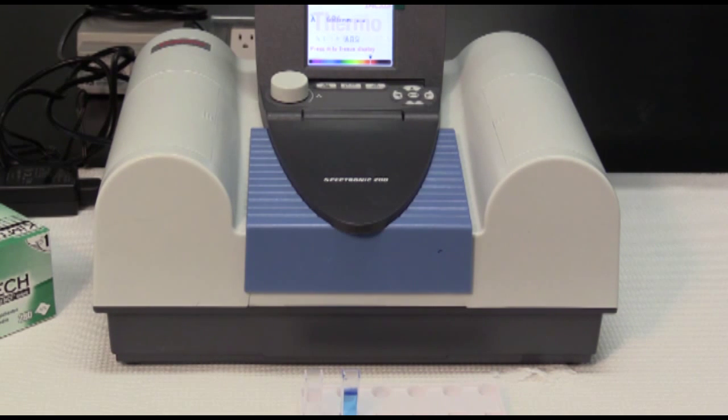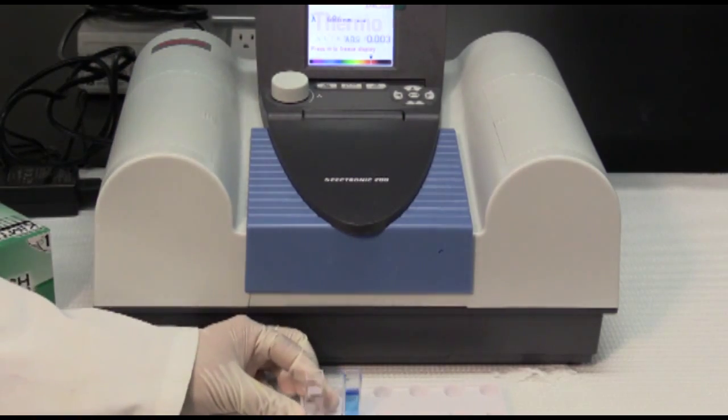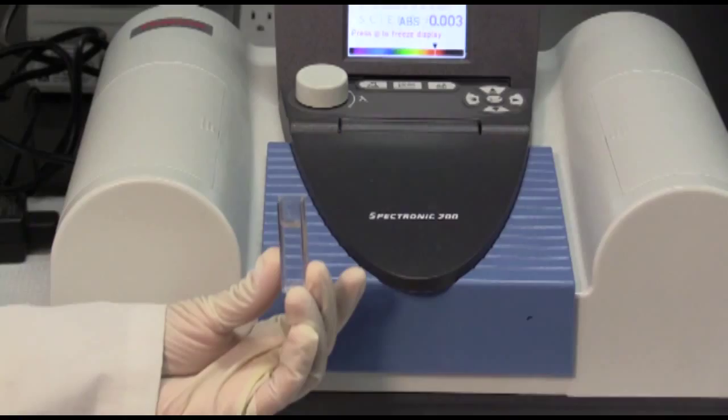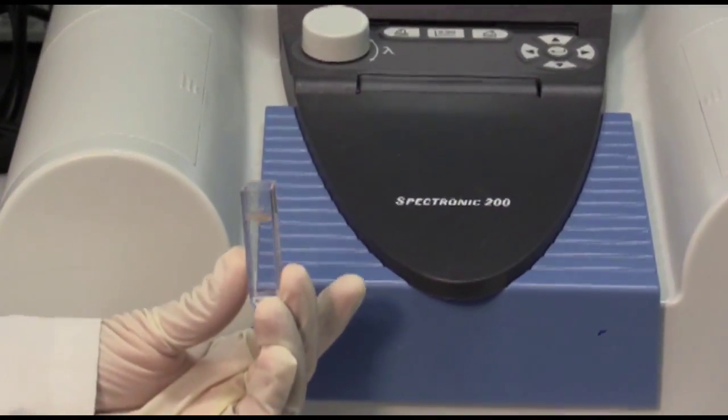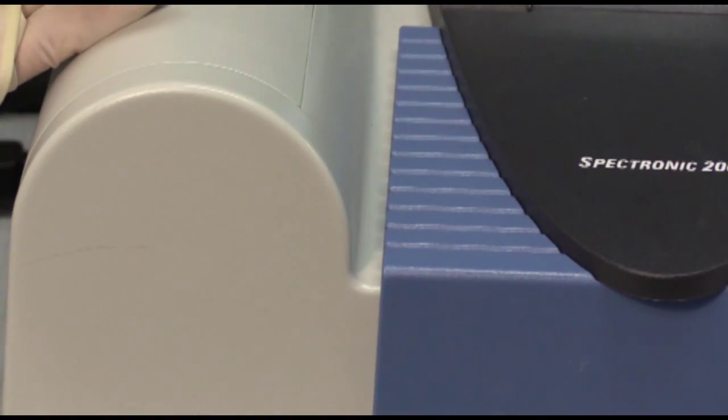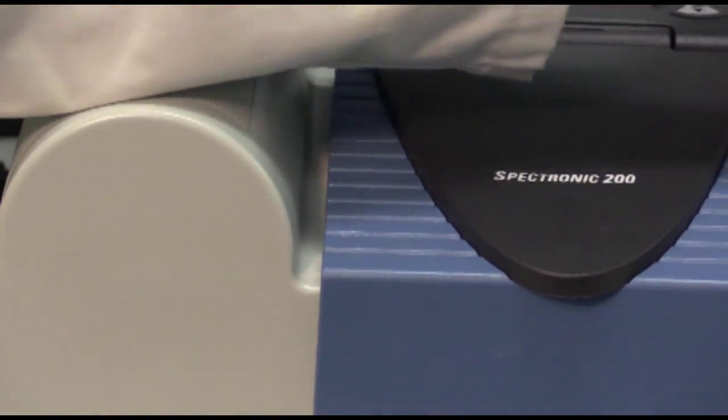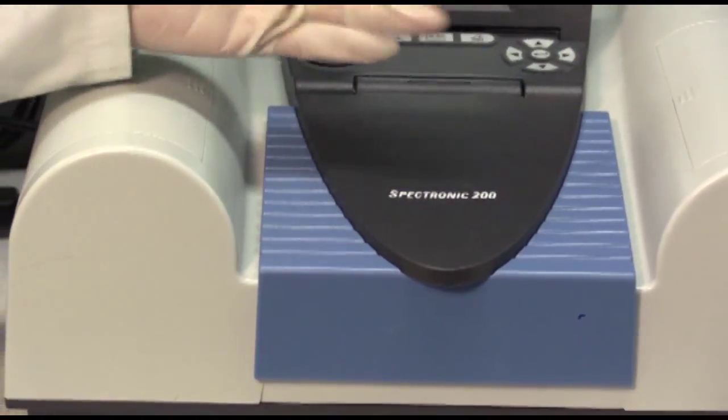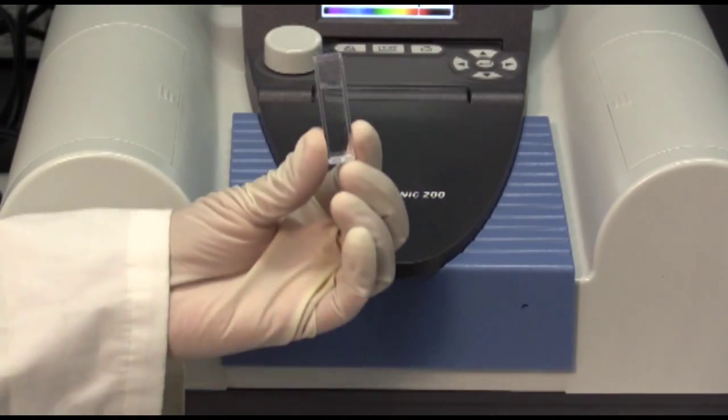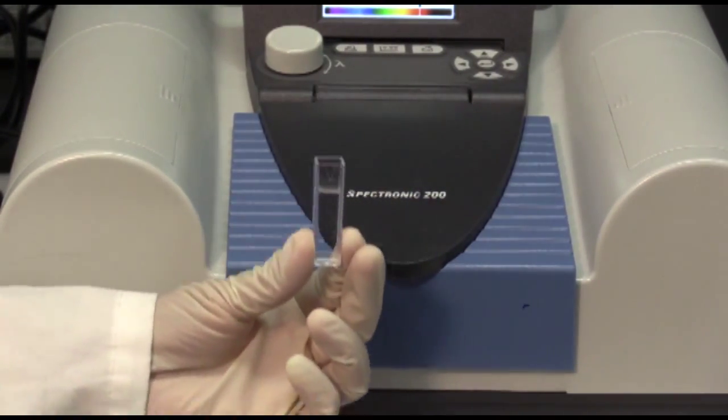Once you're ready to measure your samples, start with the blank. Take your blank, and before you put it in, make sure you understand which way the path of light is orientated in the instrument. In our particular instrument, the path of light will be going in this direction, so you want to orientate your cuvette so that the light is going through the clear sides of the cuvette.